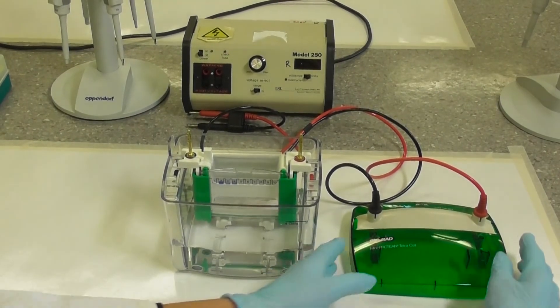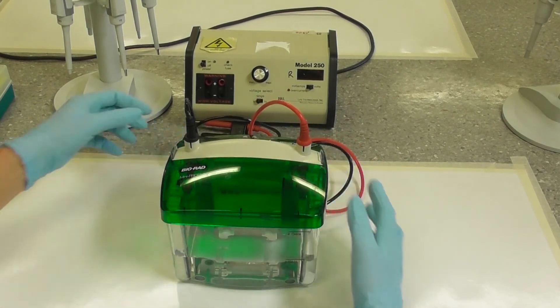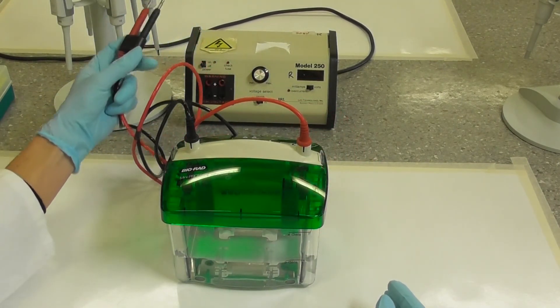Once the samples are loaded complete the assembly of the gel tank by placing the lid over the two electrodes. Black to black and red to red and press down.